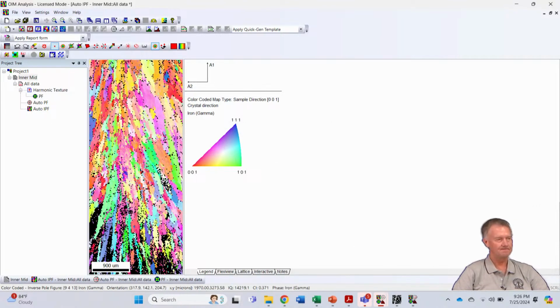Okay. To go to this low magnification, shall we keep the working distance high? Yeah, so the question is, if you have this kind of magnification where it's really low, then should you work with a high working distance? In general, that's true. It depends on your phosphor screen exactly, and if you can get sufficient signal on your phosphor screen. And if you don't have sufficient signal, you should do multiple scans and then stitch them together, or merge is the term we use. Right, merge the data sets.